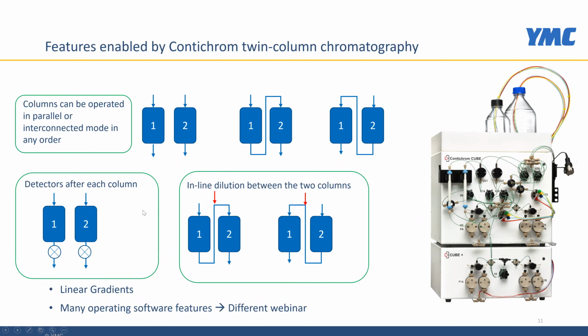Now you can also see on which position the inlet valves are and which buffer is connected to those pumps. Also, the pressures are shown here, and valve positions, and also on the left-hand side you can see the buffer levels are shown here.